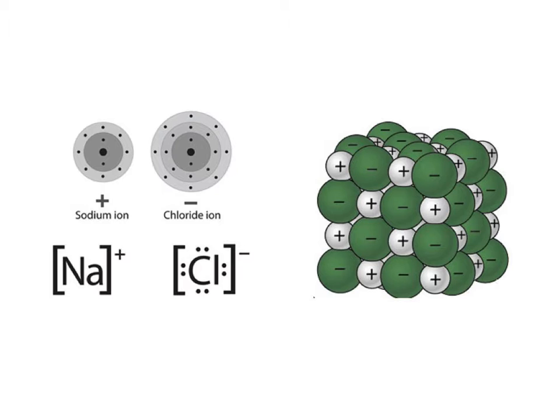Obviously, you can see here the sodium chloride lattice structure, and of course when you dissolve it in water, those ions will dissociate and they contribute to the polarity of the solvent, and as it is absorbed by the paper and moves up the paper, it will tend to interact with molecules that were also polar.